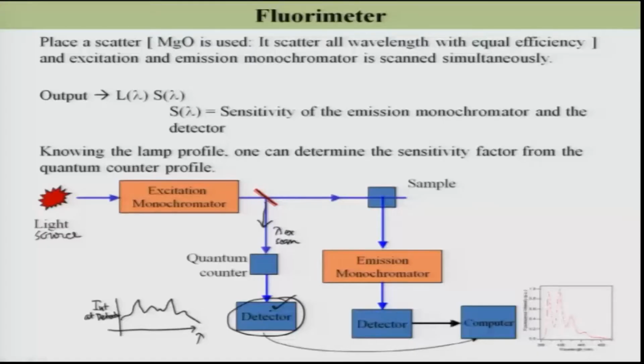So, welcome back after the break. I was discussing this quantum counter. In this quantum counter, my aim is to get the corrected emission spectra, right.